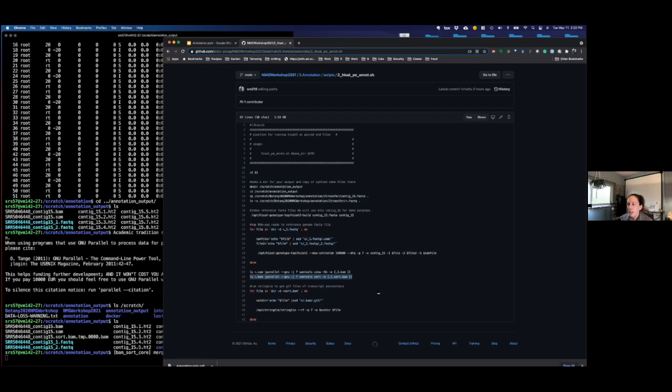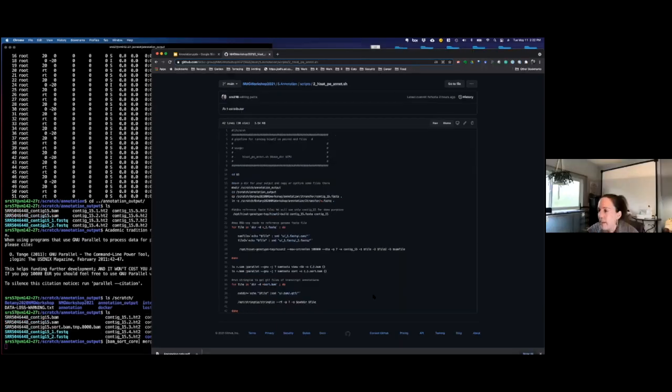And again, you might find that this file size actually shrinks a little bit after this. And also most of the downstream tools expect it to be sorted by coordinate. Sometimes things should be name sorted, but that's kind of rare. You just have to read the documentation for whatever you're trying to do. All right, and then we have our sorted BAM.